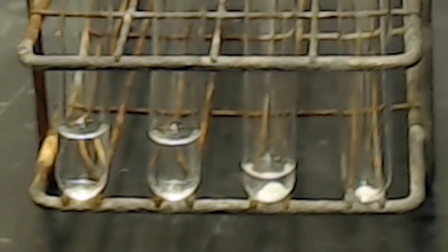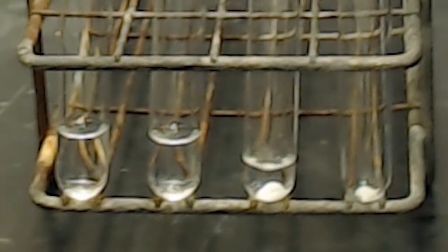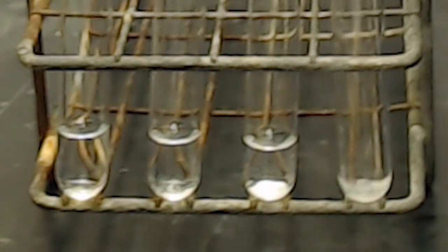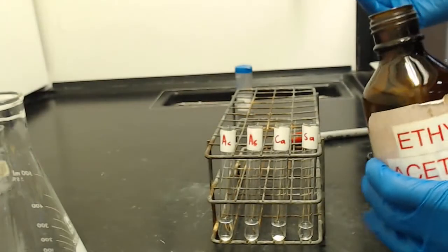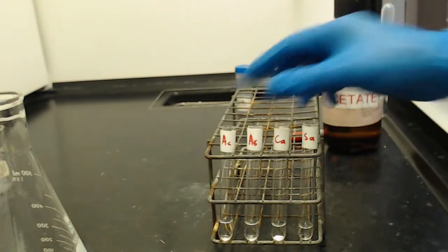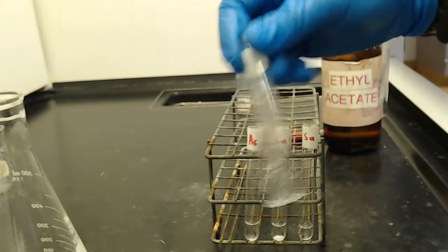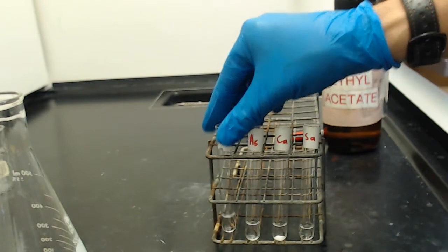Then with a gloved hand, I'm going to give it a nice shake. You could put a stopper on these, but I'm not going to worry. Nothing is dangerous to work with today. These are all over-the-counter analgesics, and ethyl acetate, as you may know, is a significant component of nail polish remover. So nothing too dangerous today. I'm giving each of these a nice little shake. Once again, I want to be clear about the gloved hand for this because it's really easy to get this on your hands.